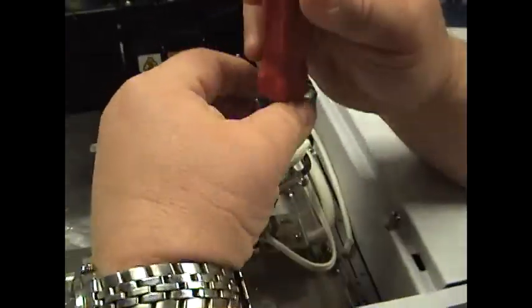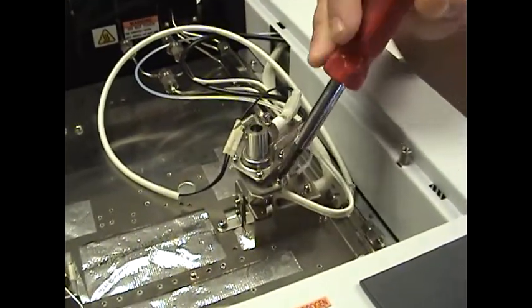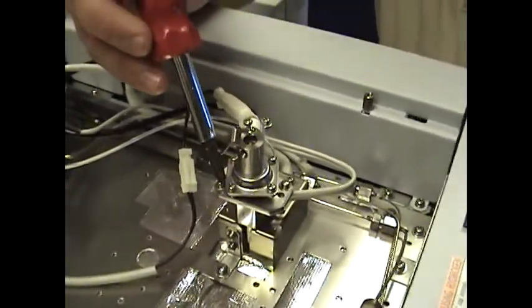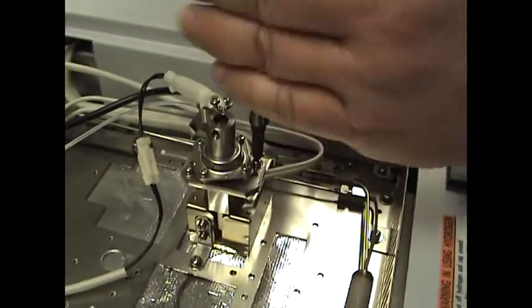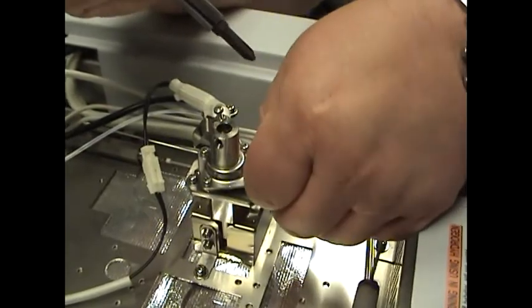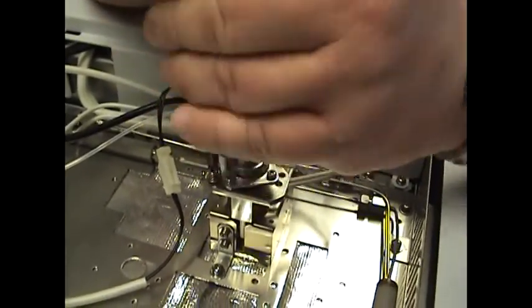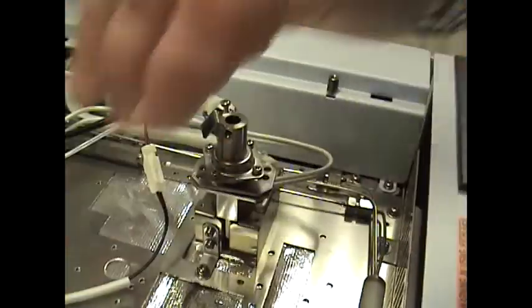First thing you want to do, you'll see two screws — one right here and one on the backside. Go ahead and remove those screws. Once again, make sure this is cooled down — you don't want to burn yourself. Set that screw aside so we don't lose it.